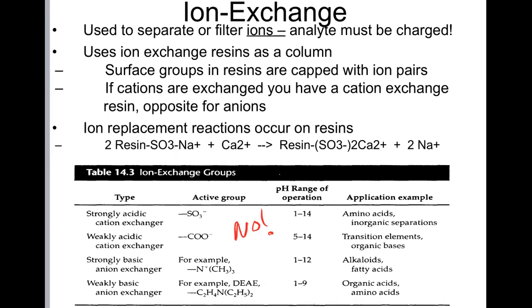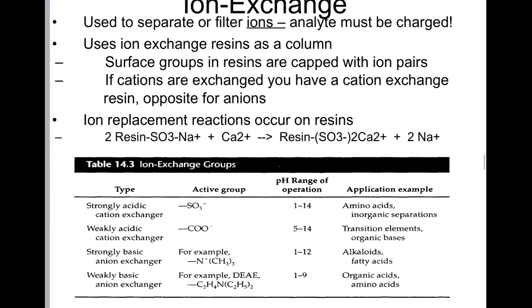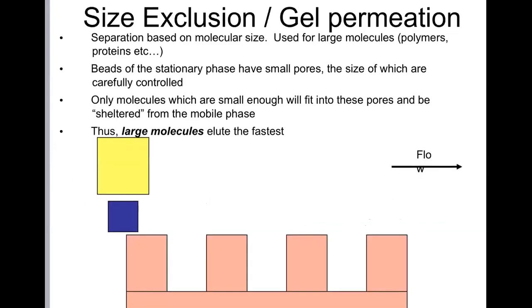The answer is no. If you're wanting to separate cations, you have to use a cation exchange column. If you're wanting to separate anions, you've got to use an anion exchange column. They're fundamentally different. Their chemistry is different. These charge groups are different. You can't make one separate the other. It won't work, okay? But there's nothing that says you can't have two columns, one for cations, one for anions, and oftentimes that's done, okay? But nonetheless, ion exchange chromatography is very useful to separate or filter ions, basically.